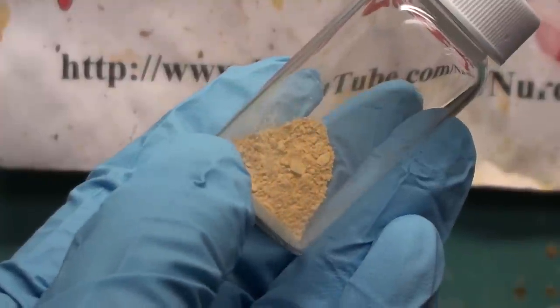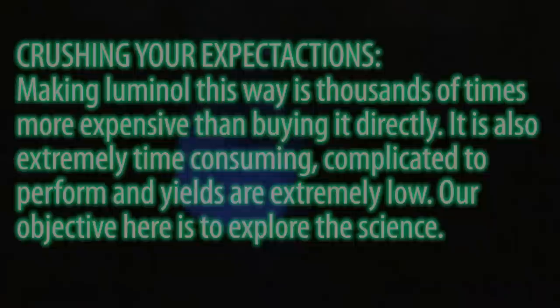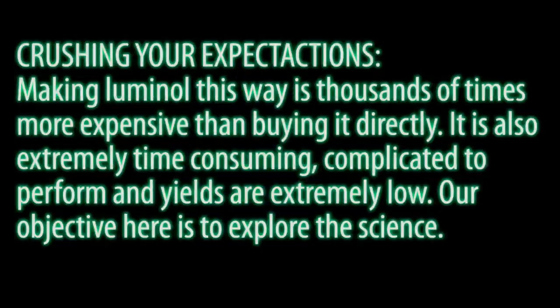Greetings fellow nerds. In this video we're going to make luminol, a really famous chemiluminescent substance. First I need to crush your expectations. Making luminol this way is thousands of times more expensive than buying it directly. It is also extremely time consuming, complicated to perform, and yields are extremely low. Our objective here is to explore the science.